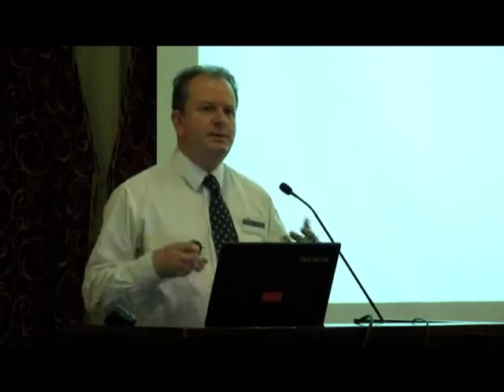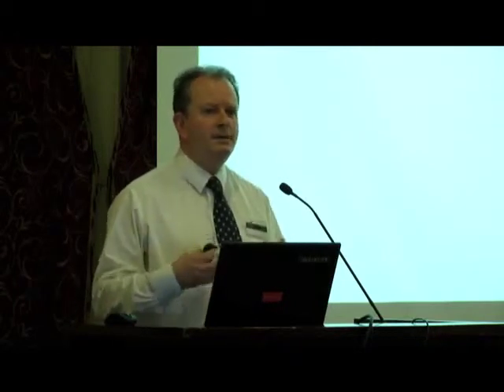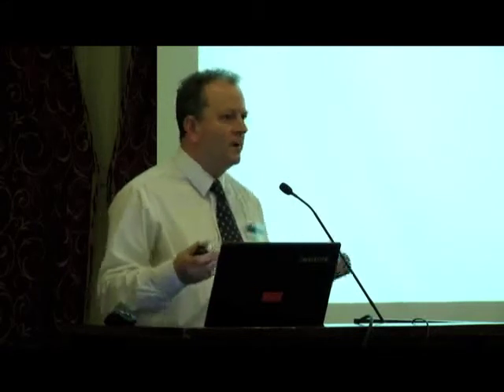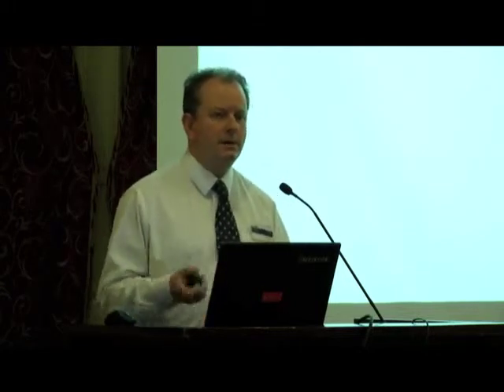Okay, so conductivity measurement in a water system is effectively a measurement of the ionic activity in the water. Compounds, when they're dissolved in water, will dissociate and break into their ionic form depending on how much energy you put into the water system. So these compounds are breaking into their ionic form and recombining again, and when they are in their ionic form, they can allow the water to carry an electrical current, and that's how we measure conductivity.